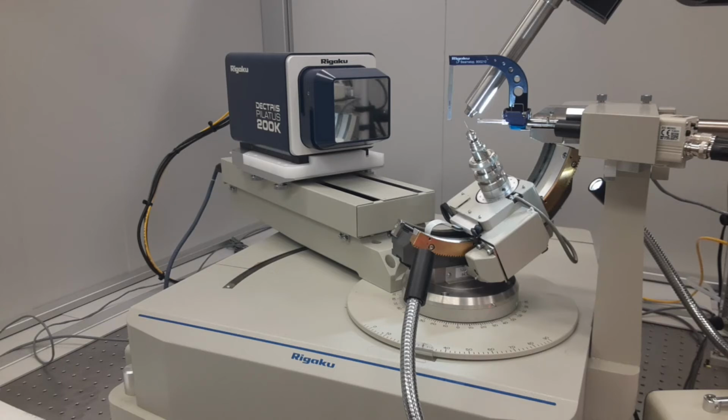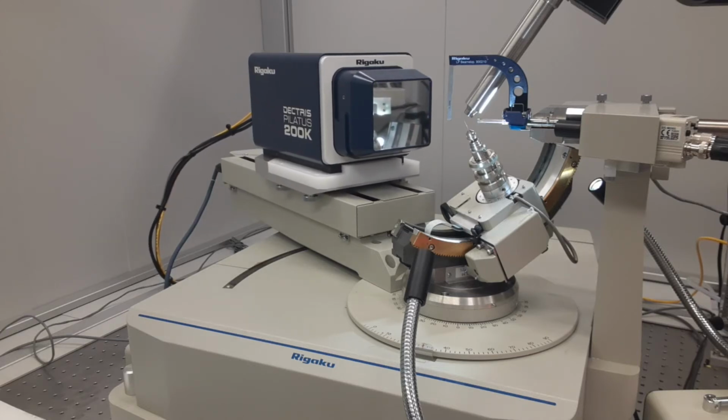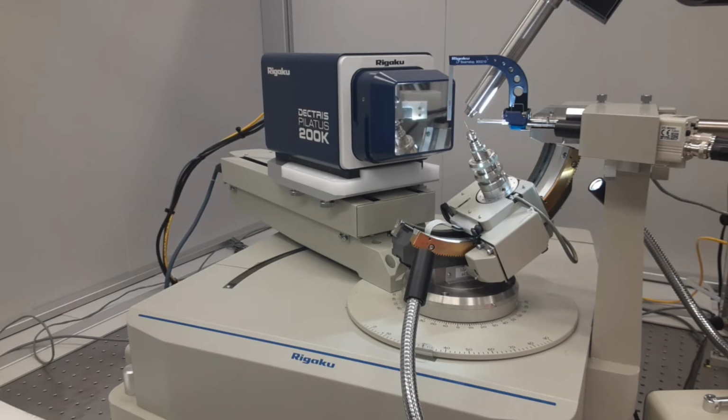And of course we can change the detector distance during the collection. Right now it's at 200 millimeters, which is sort of the working distance when you put your crystal up. So I can move that in closer. And here it is moving in for a collection. So again, that's the AFC11 4-axis goniometer. It has 4 axes of rotation plus the movement of the detector, and that allows us to use the pixel array detector as efficiently as possible. And you'll see that later when we set up a strategy to collect.